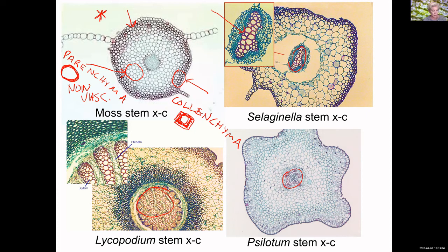Now, when we look at our vascular tissue cells, compared to the cells around them, they're going to be larger and they're going to have a thicker cell wall, and it's actually going to be made of a different material. It doesn't necessarily have a super thick cell wall, but these sclerenchyma cells have a material in the cell wall called lignin.